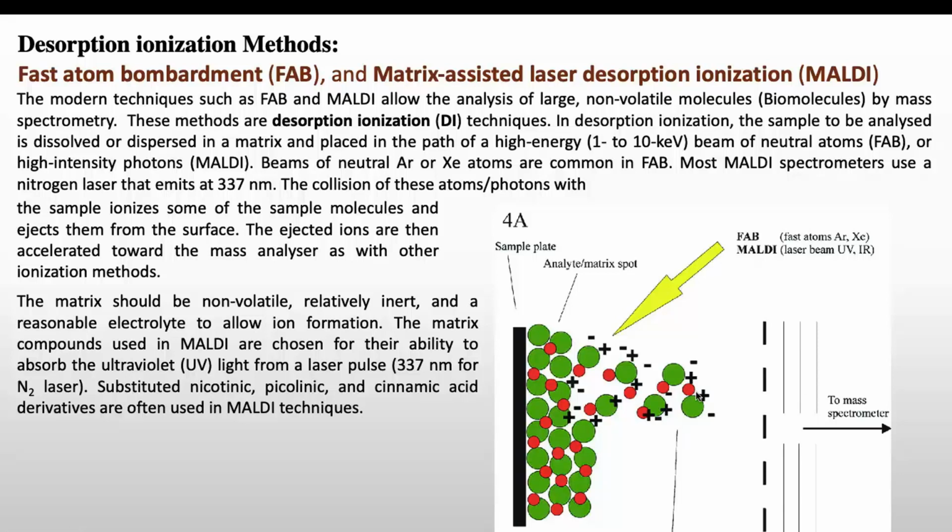Now the matrix also should have some properties here, and one of the important properties is that it should be non-volatile, because if you are using a beam here, it should not evaporate, and it should be relatively inert and a reasonable electrolyte to allow ion formation. The matrix compounds used in MALDI are chosen for their ability to absorb the ultraviolet light from a laser pulse, that is 337 nanometers for the N2 laser, which we mainly use in the MALDI technique, and substituted nicotinic, picolinic and cinnamic acid derivatives are often used in the MALDI technique as a matrix.